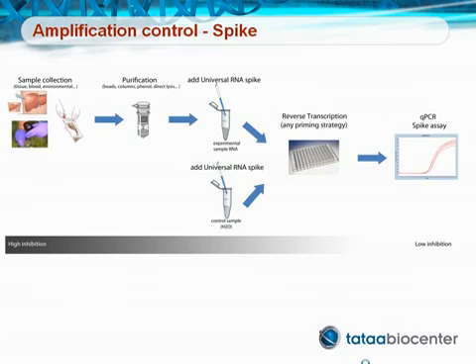To help you evaluating assays and the results, there are also commercially available reference RNA, cDNA, and genomic DNA from different organisms.